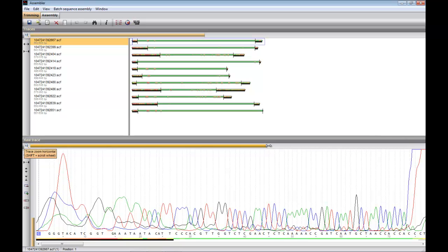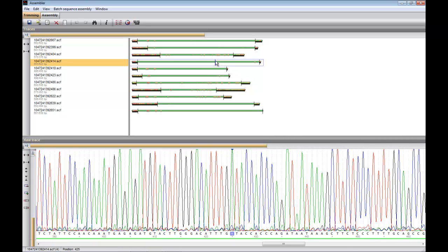If I click on a sequence in the upper panel, the cursor will automatically jump to the same location in the trace file panel.